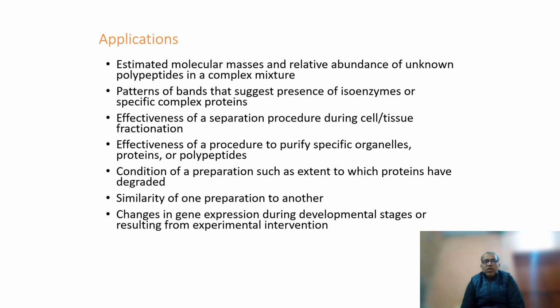As applications of electrophoresis, we can determine the molecular mass and the effectiveness of the procedure to purify specific organelle proteins or polypeptides. We can also use it to identify and quantify proteins as well as DNA using electrophoresis.